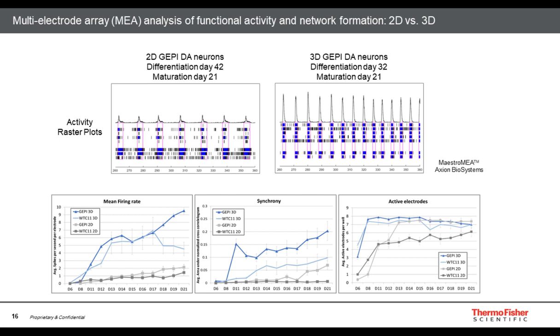So my colleague Michael Durr took a different approach to recording activity of these iPSC-derived dopaminergic neurons. As I told you about with the FOXA2 OTX2 staining, Michael performed floor plate specification and expansion in 3D for 11 days before dissociating the organoids and replating them onto the M8 surface.